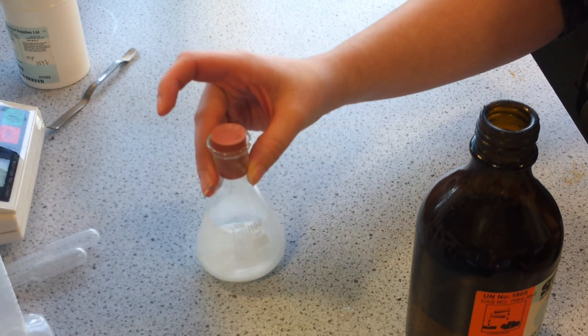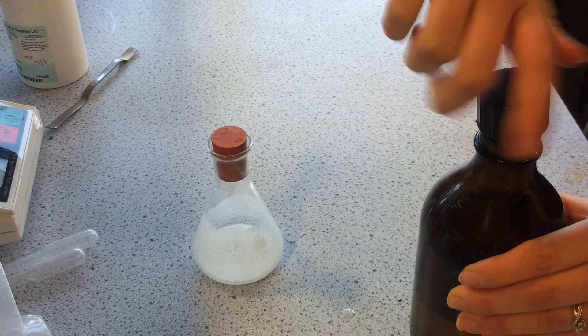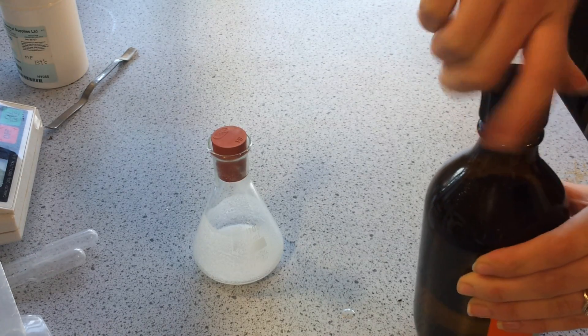So those are all the ingredients for making aspirin. We're going to swirl them together and then add it to a beaker of warm water for about 15 minutes.